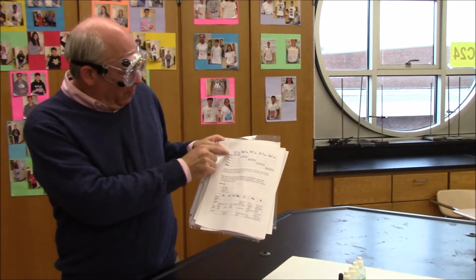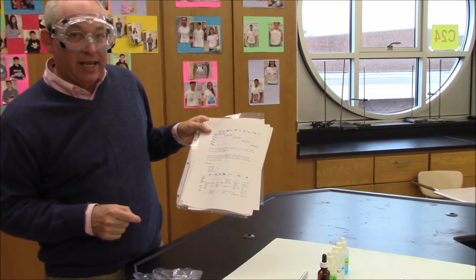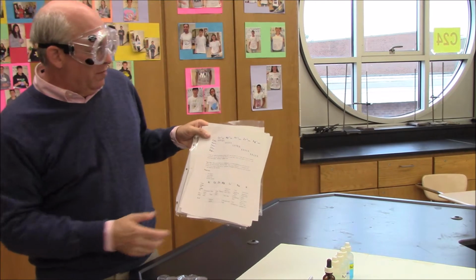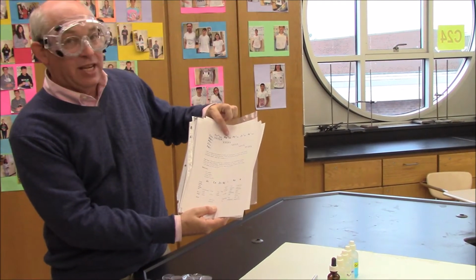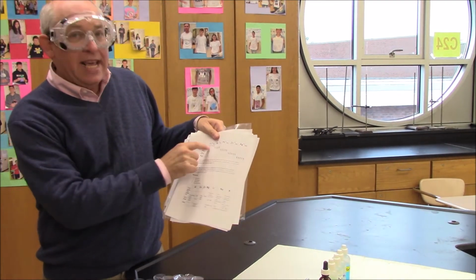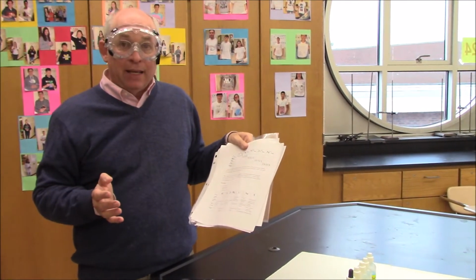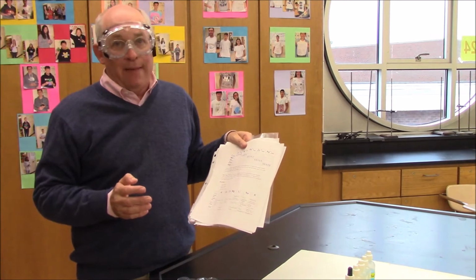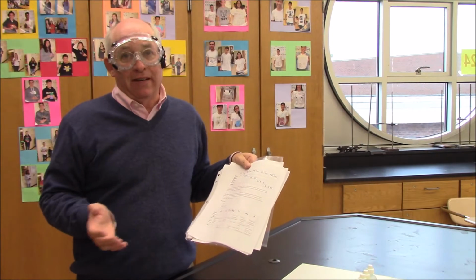So down the left side are the 5 metals: copper, magnesium, lead, zinc, and silver. And across the top, you'll see that we've got aqueous solutions. So this is copper nitrate, magnesium nitrate, lead nitrate, etc. And all we really need is a yes/no. You don't even have to really put observations. It's, did a reaction happen or not? And a reaction happening would be anything you see that indicates that. It'll be primarily color changes.